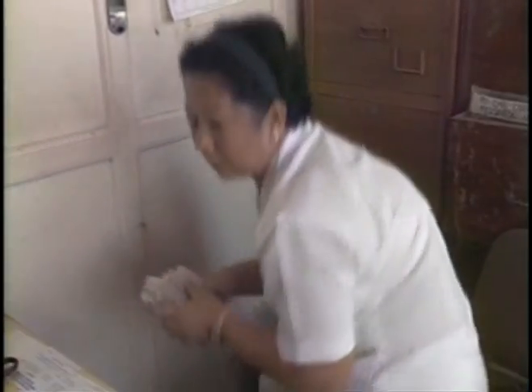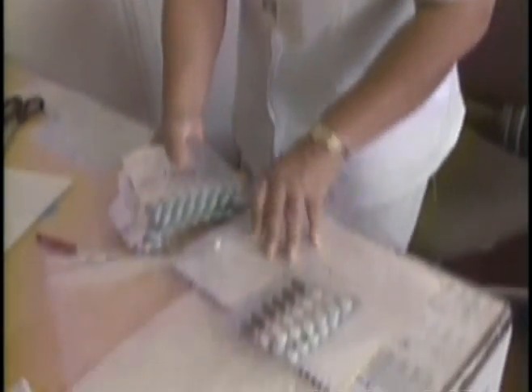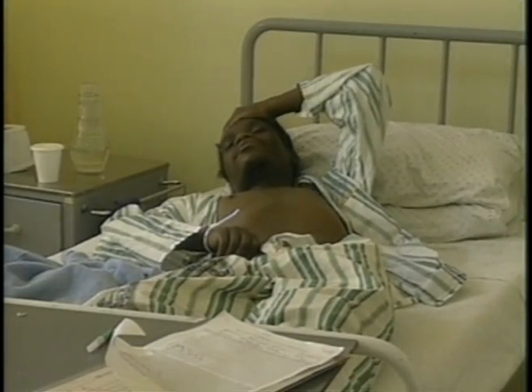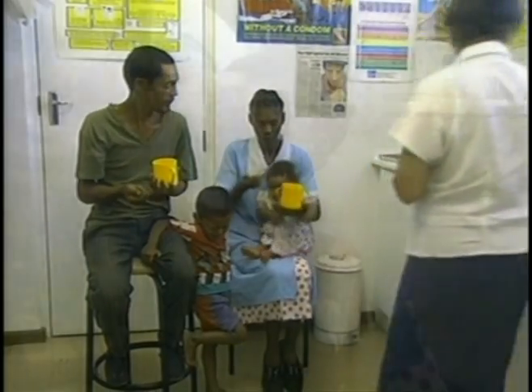An erroneous report can have devastating results. If a false positive is reported, a patient will be placed on treatment unnecessarily. If it is a follow-up, treatment is lengthened, valuable medication is wasted, and sadly, it can cause emotional trauma to patients and their families. Patients may lose confidence in the program itself.